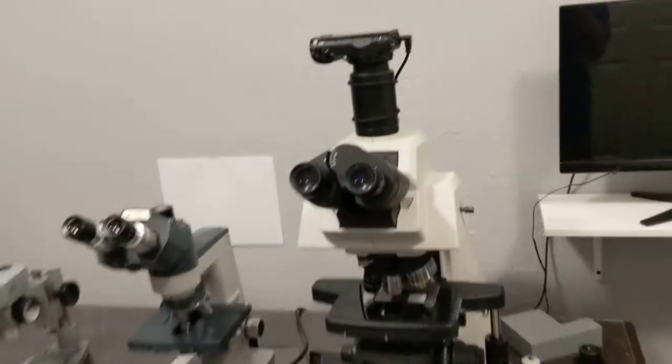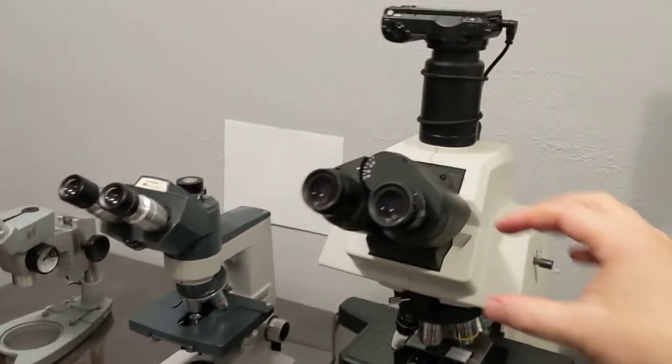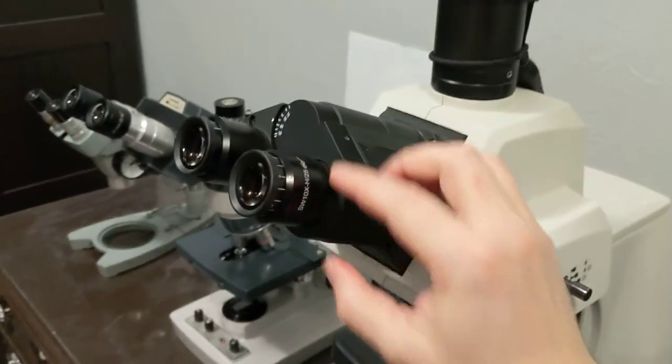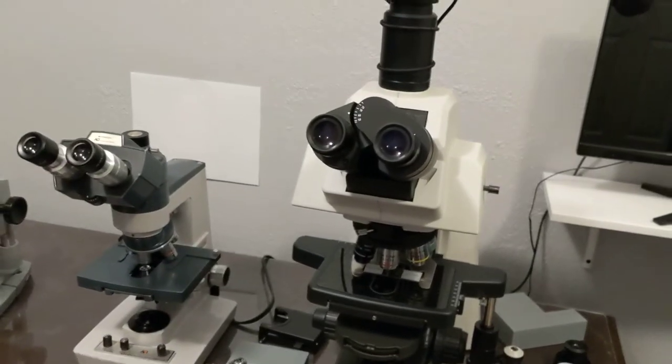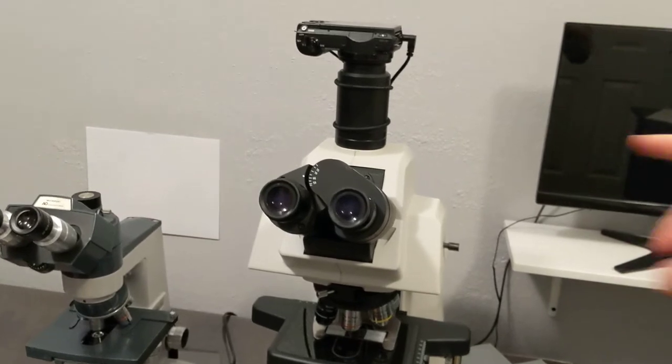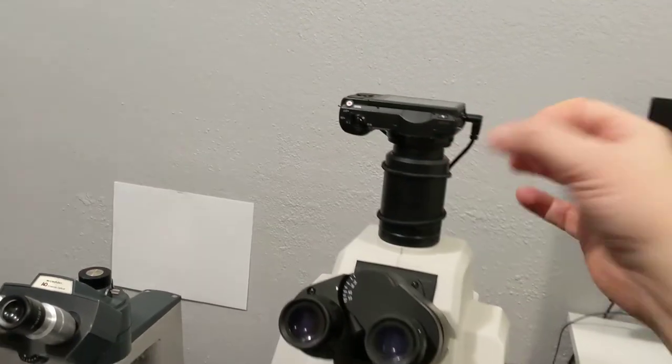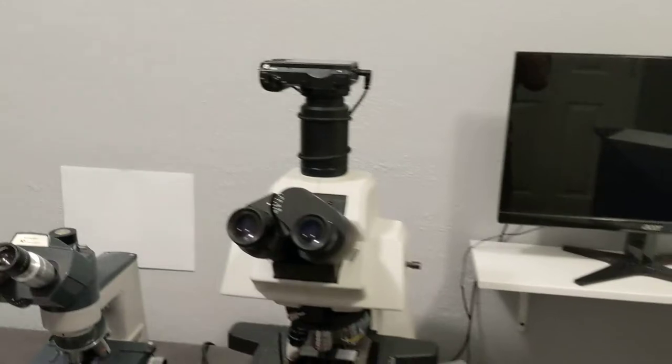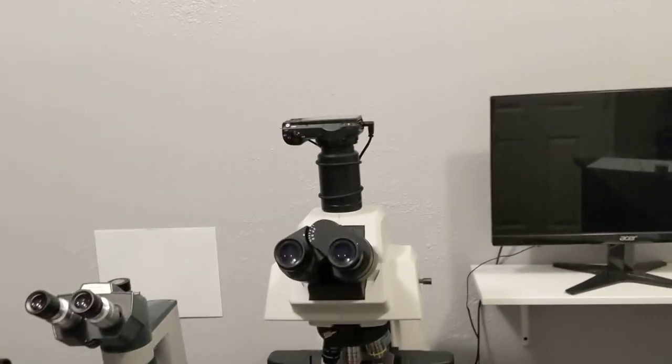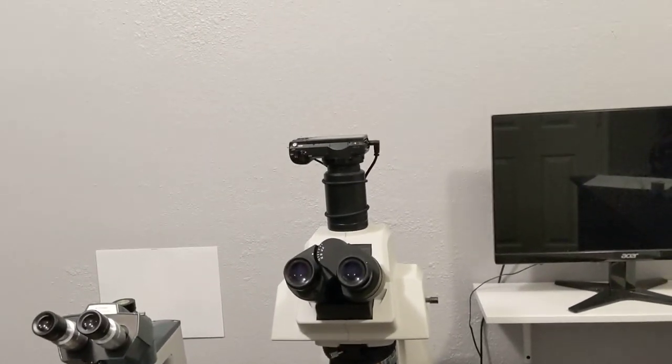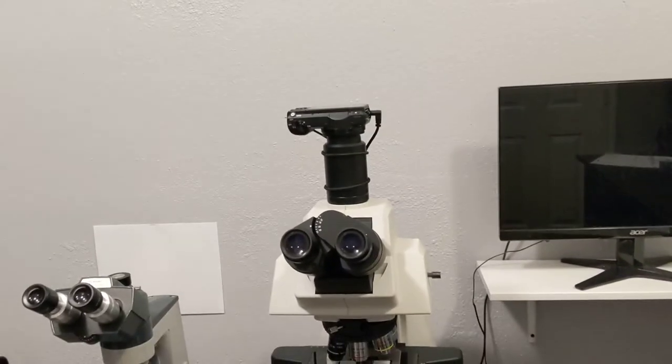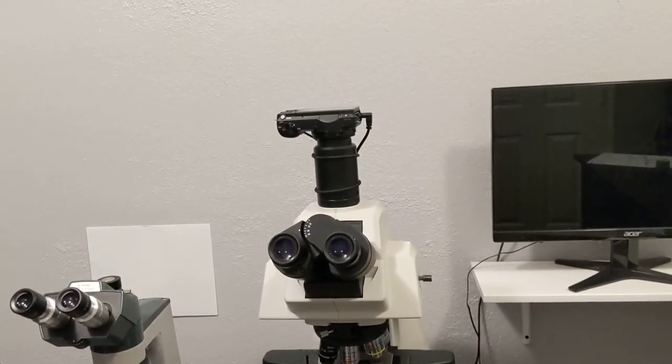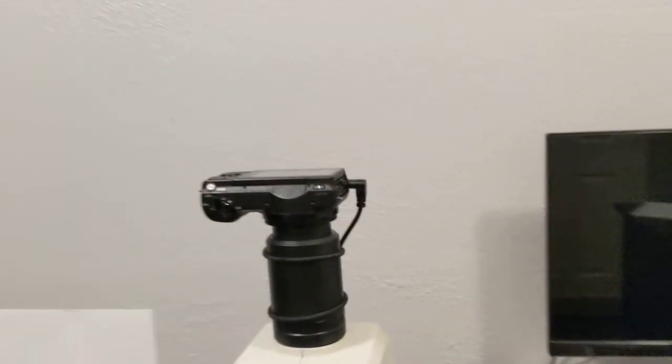Interestingly, the view that I see through the eyepieces, these are really wide-field eyepieces, 25 millimeter, is noticeably larger than what the camera's able to pick up. I think the actual size of the C-mount opening is a limiting factor. I'm going to probably figure out some better solution.